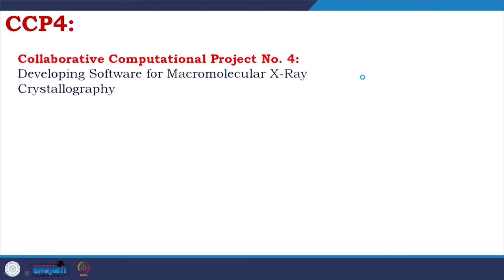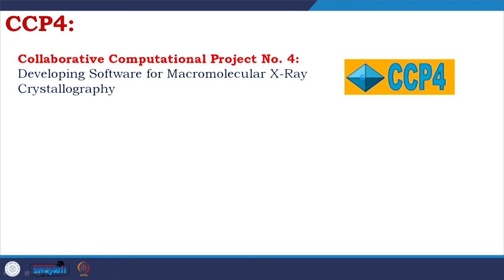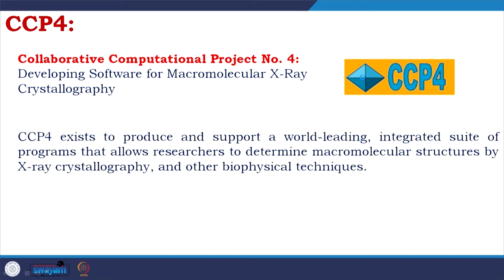And before going to the next step, I want to introduce CCP4. CCP4 is Collaborative Computational Project 4. It is developing software for macromolecular X-ray crystallography. This is the logo of CCP4. CCP4 exists to produce and support a world leading integrated suite of programs that allows researchers to determine macromolecular structures by X-ray crystallography and other biophysical techniques.